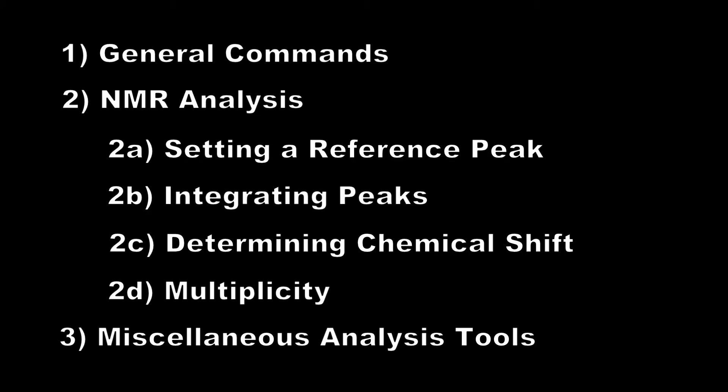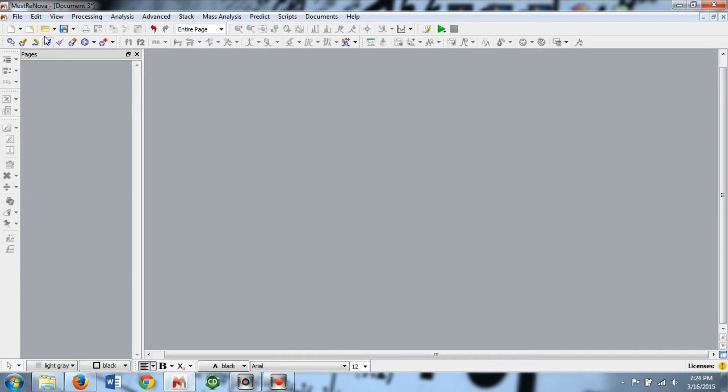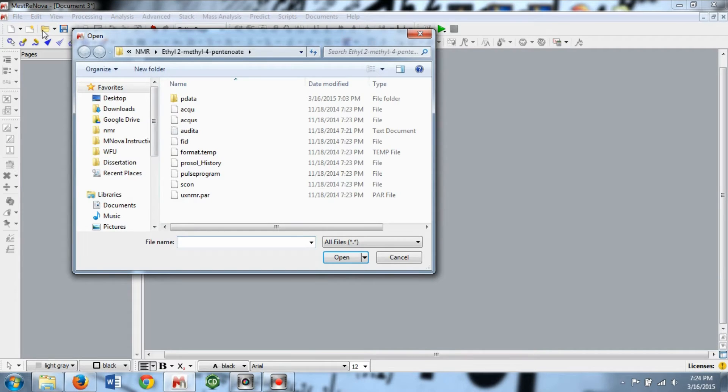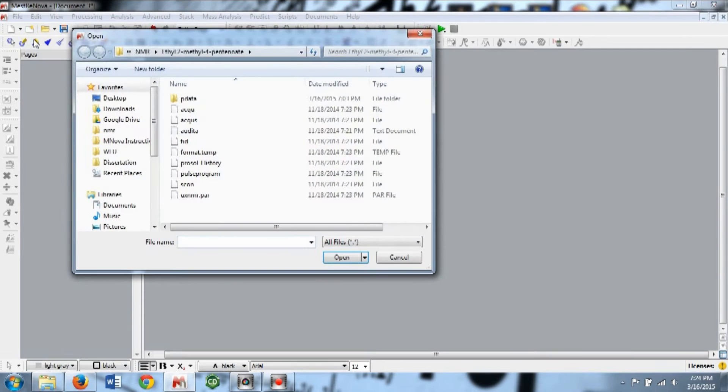Topics covered in this video include general commands, NMR analysis, which will involve setting a reference peak, integrating peaks, determining chemical shift, and multiplicity. And finally, I'll go over some miscellaneous analysis tools. We'll start by opening a file. Click the folder, which is the Open button, or go to File Open in the menu.